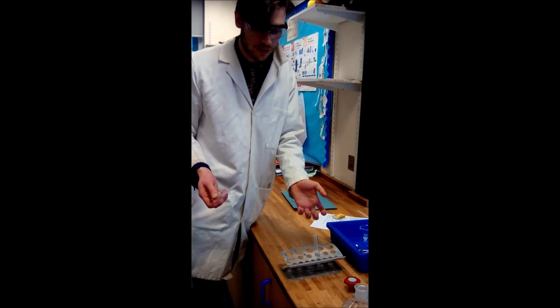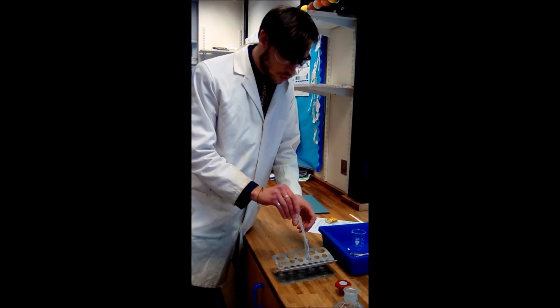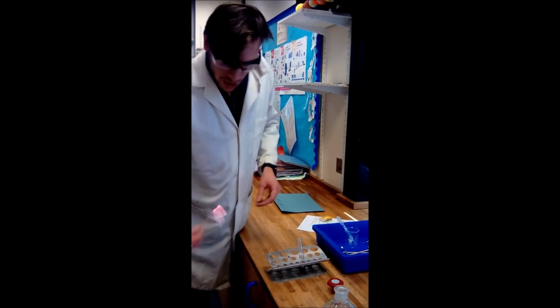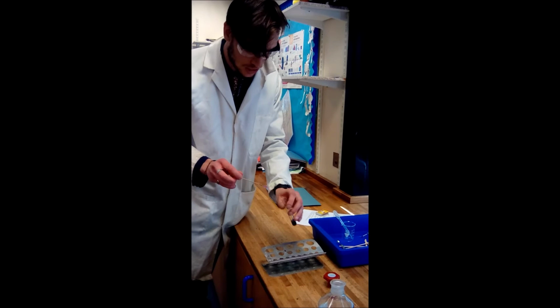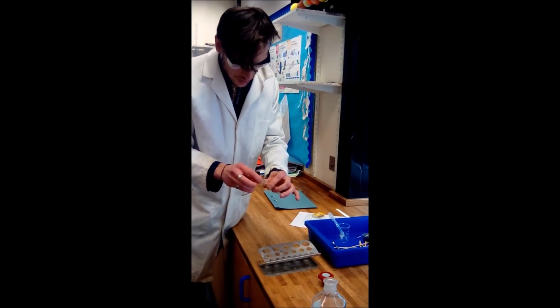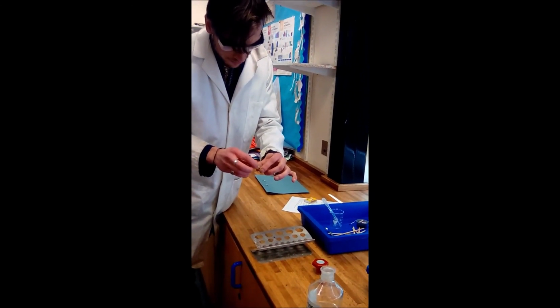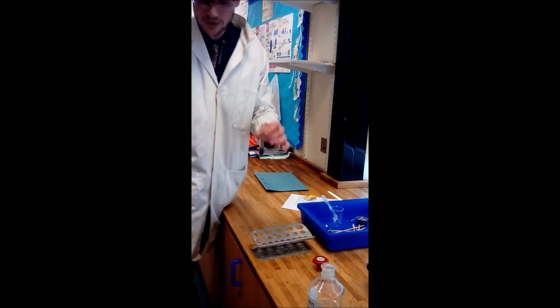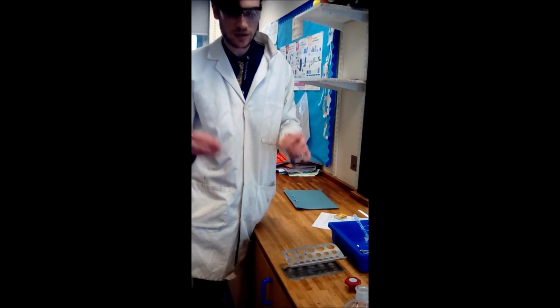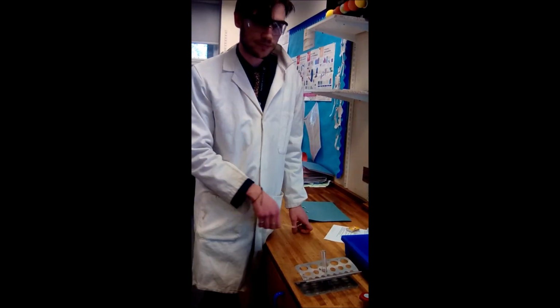So I'm going to have a glowing splint. It's not going to be a flame, but it's going to be red hot and glowing, and it should relight, because this reaction should create enough oxygen that if I add my red hot, glowing splint to it, it should relight. And there we go. As you can see there, that bright red flashing light is because there is oxygen being released in here. So it's trying to relight my splint. So therefore we have oxygen present.